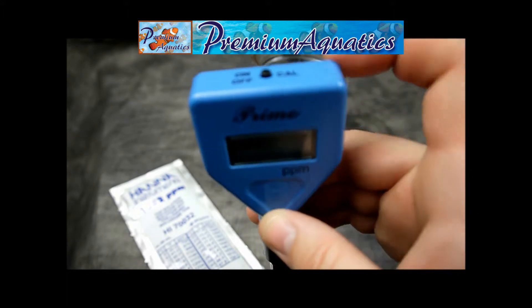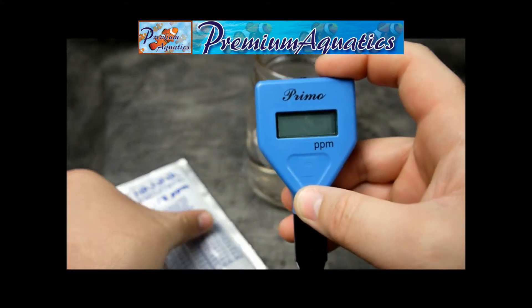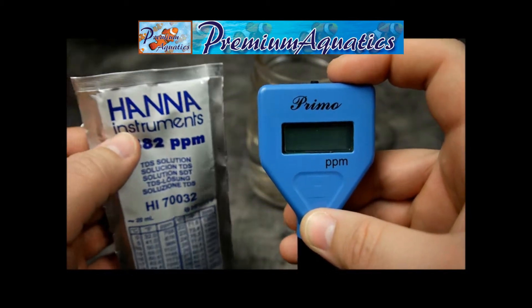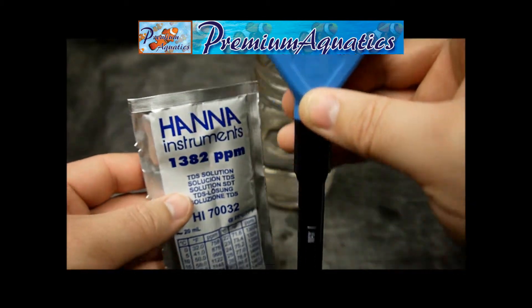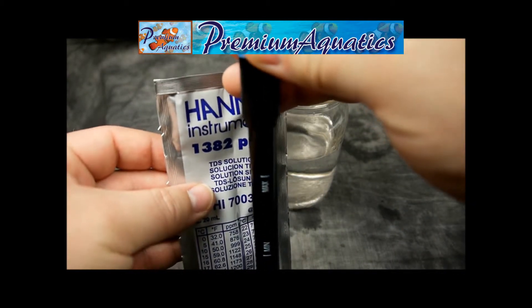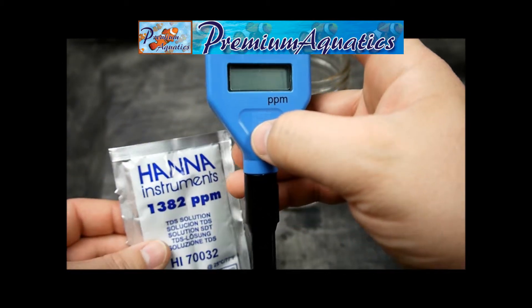To calibrate this, all you'll need to do is hold the calibration button for three seconds. It will then display the reading it needs to measure, which is 1382. You'll open your packet that's supplied with the unit and swirl the probe in it at the right level for about 20 seconds. Once the LCD screen stops blinking that 1382, you'll be ready to go.